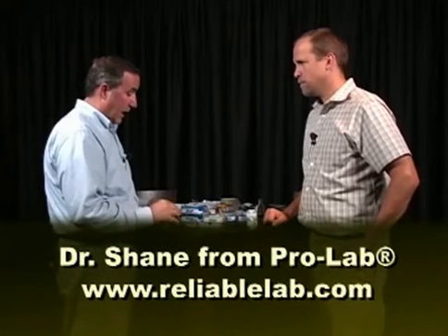These other samplers have come on the market since the Aerocell, and they have their own merits. Each of these has good data to support their impaction efficiencies. If you look at the Positrack Allergenco D that has the barcode, one of the good things about this is that when they open it up, that slide is already pre-labeled for you. All it needs is mounting medium, a cover slip, and you're ready to go. And you can track it any place in the lab, at receiving, at preparation, and at analysis, uniquely identified. It's a good advancement. I really quite like that.